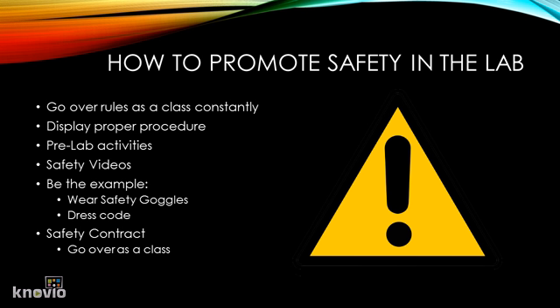Second idea is to display proper procedure yourself. So if you say something, you do it that way. If you tell students everybody wears goggles in the classroom, the teacher isn't the one exception to that. The teacher should also be displaying proper lab safety procedures.